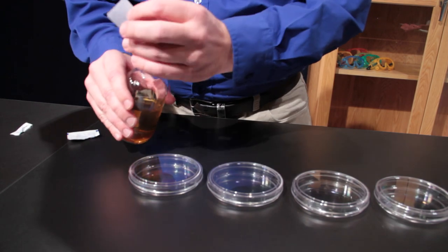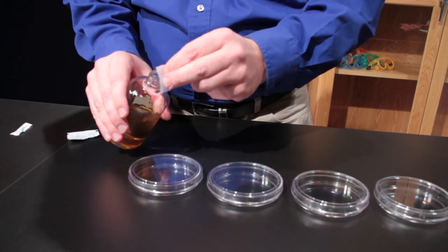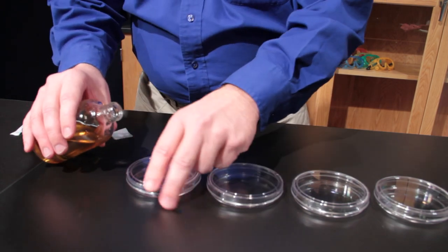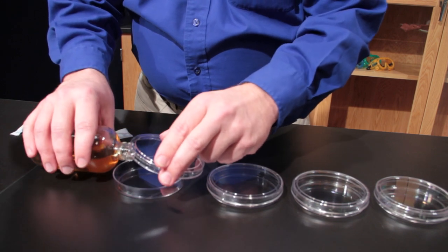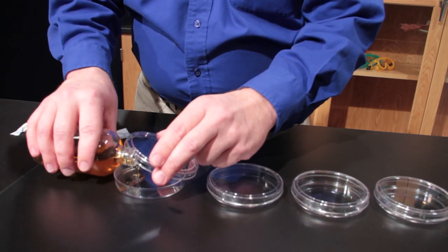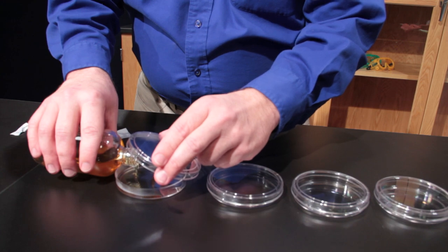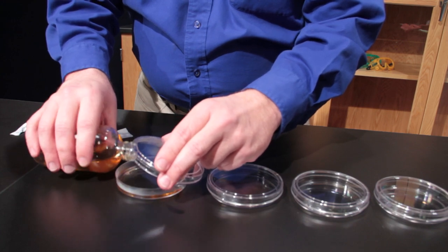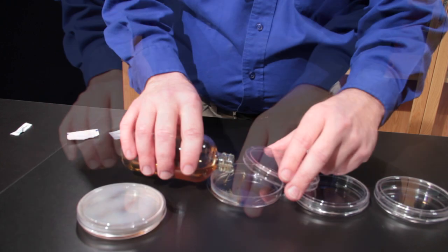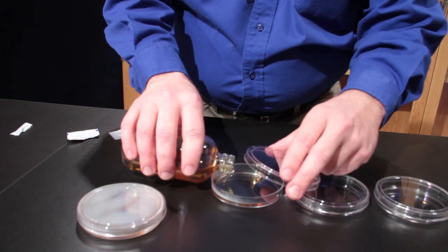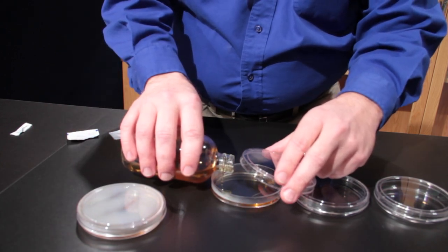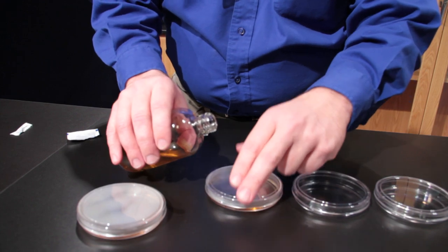Flame the mouth of the bottle with a Bunsen burner or wipe it with an alcohol pad. Keep the bottle at an angle at all times to prevent contamination while pouring. Lift the lid just enough to pour the plate. Pour just enough to cover the bottom of the plate, then replace the lid. One bottle should pour four to five standard plates.